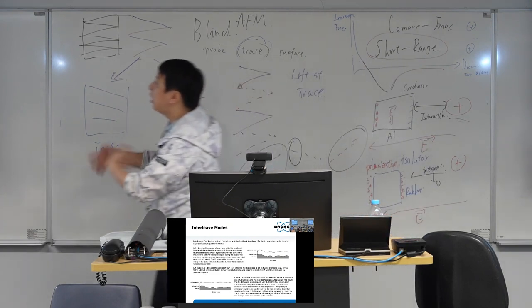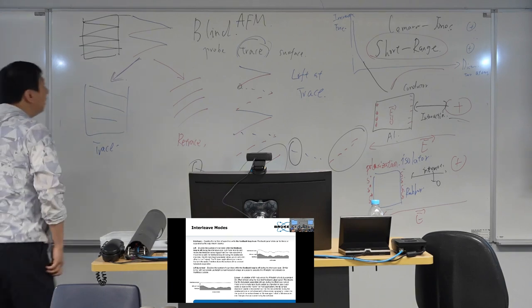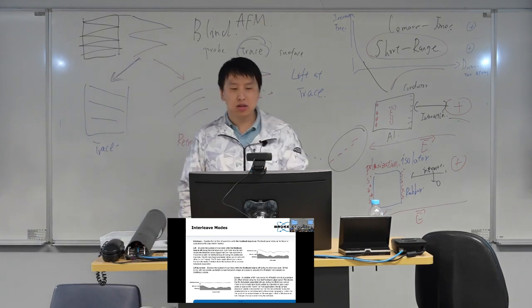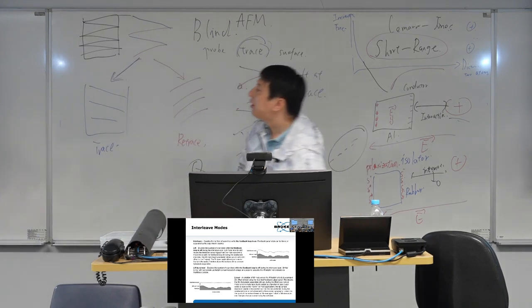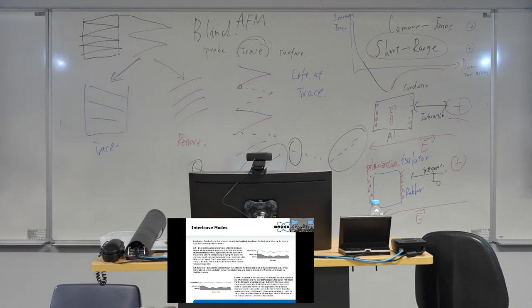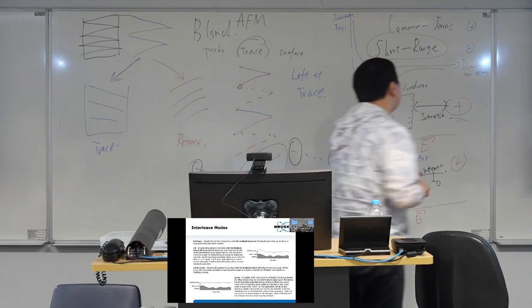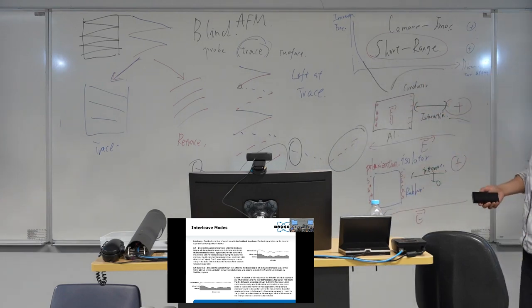Then in our AFMs, there are several interleave modes. The interleave modes we would like to use are this kind of lift. In the software, you will see 2 lift modes. One is lift by sensor. We still give a brief review about the sensor here.